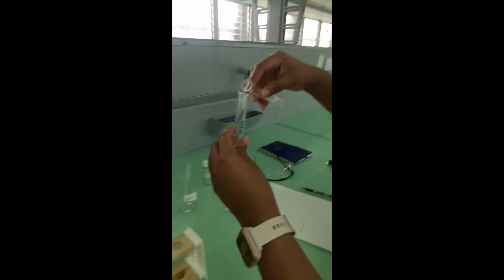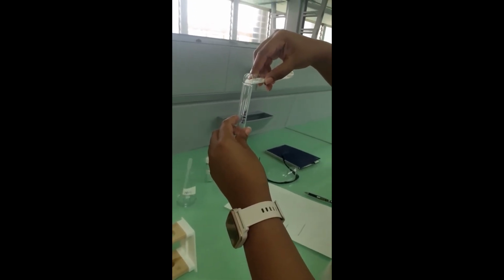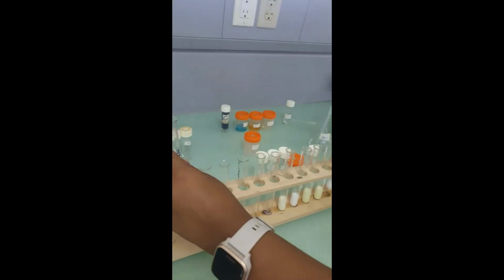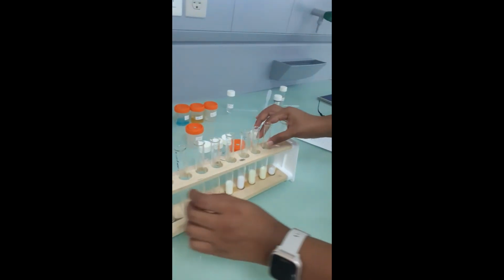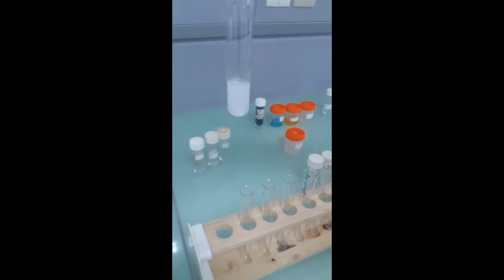So now we'll divide the chloride in half. We'll test one half with ammonia solution and the other one with nitric acid. So we're adding nitric acid to the first half. This is the chloride. Okay, and then we'll add ammonia to the second half.